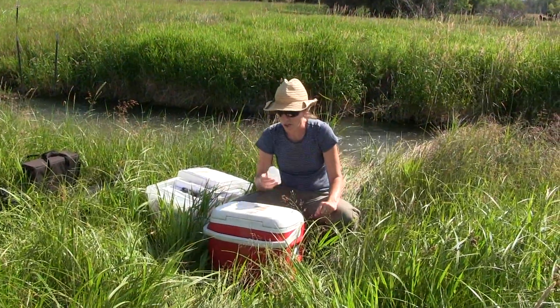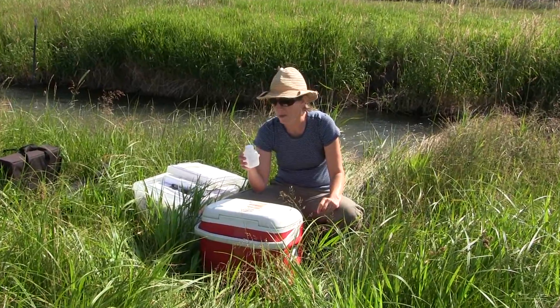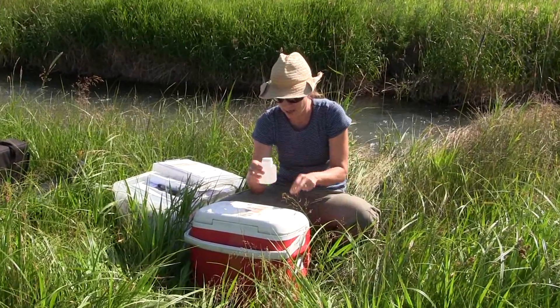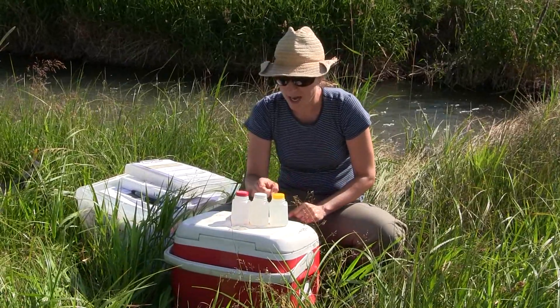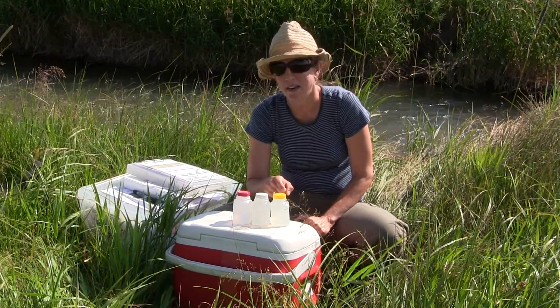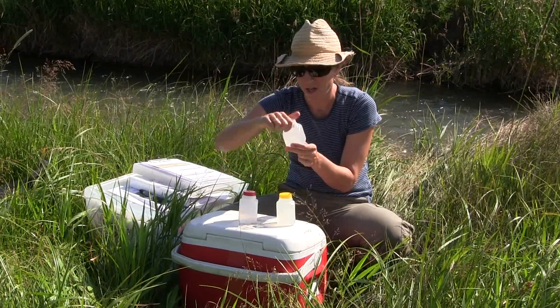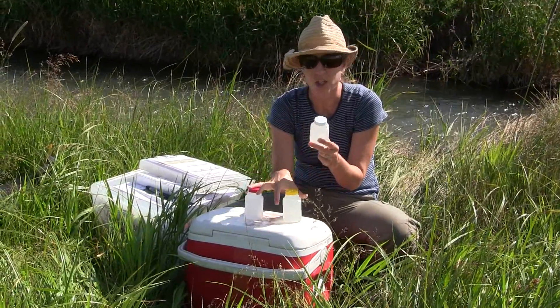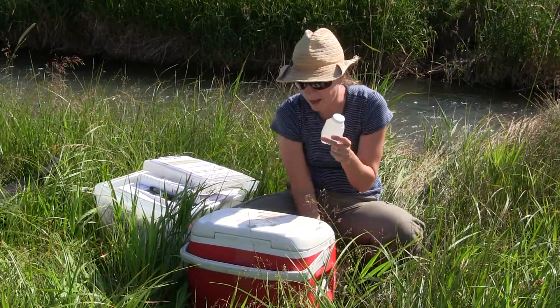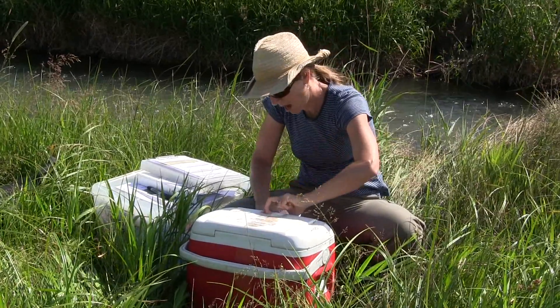Once your bottles are filled from the stream, it's time to preserve them. We have white and yellow caps at every site, and at some sites a red cap as well. Provided you've filled out the time and the label is completely filled out, you're done with the white cap bottle — it doesn't need preservatives, so just store it in your cooler on ice.